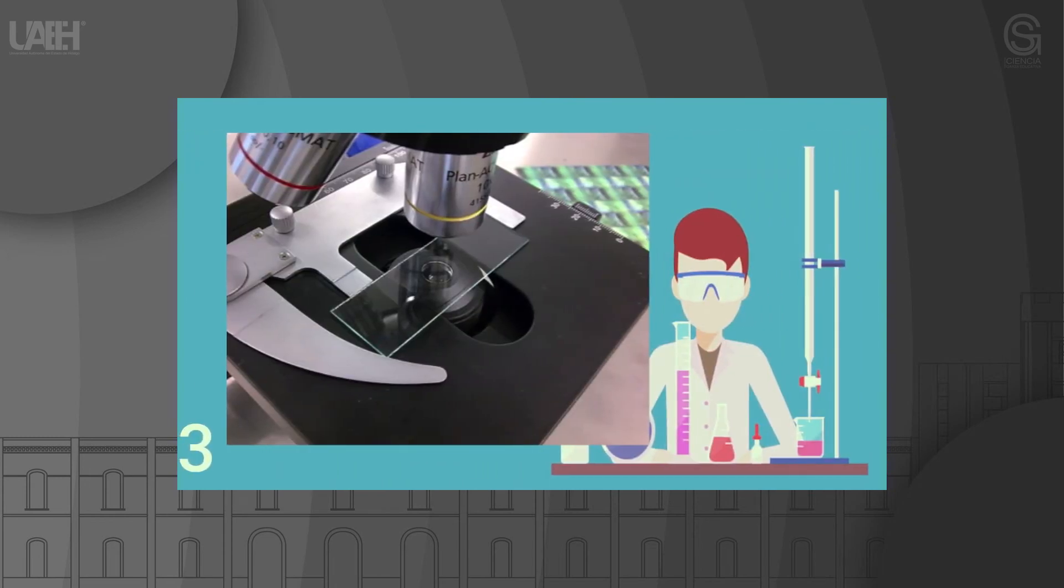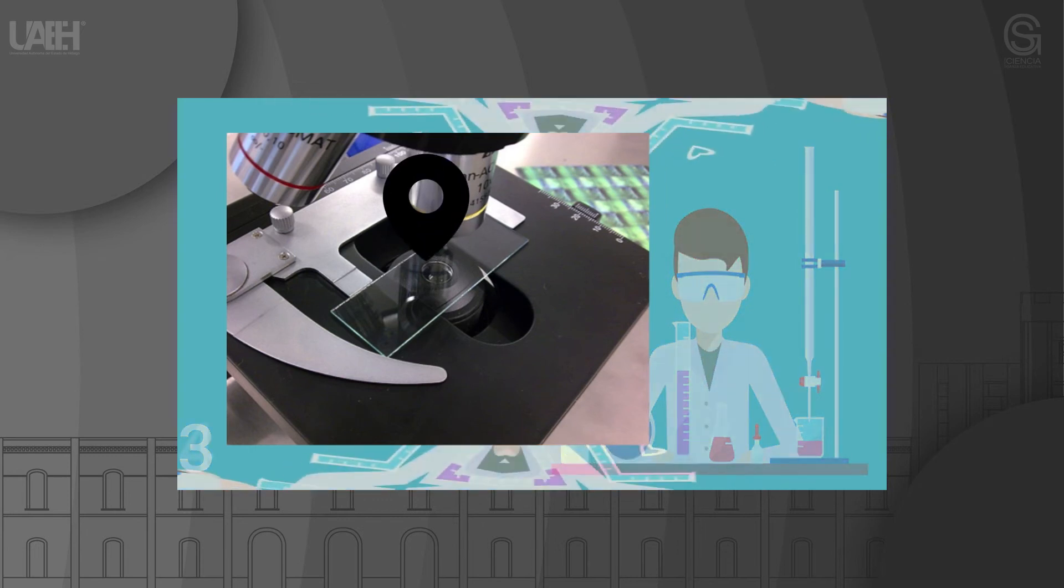Tip 3: Make sure to always cover your samples with a cover slip. This is necessary for good preparation and can also prevent the objective and samples from coming in contact if you mistakenly bring them too close when adjusting the coarse screw.